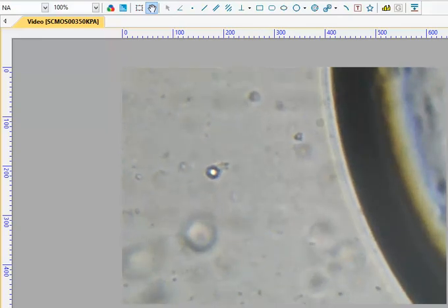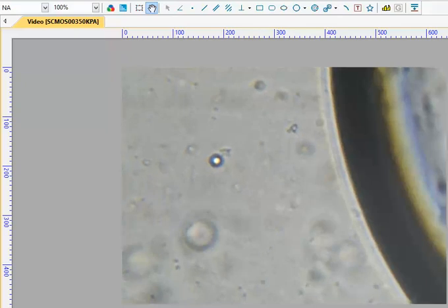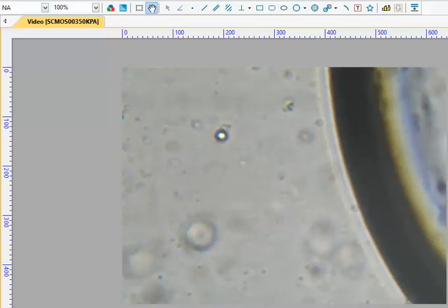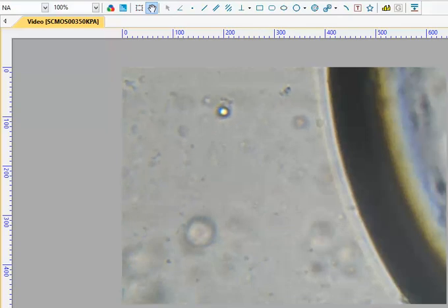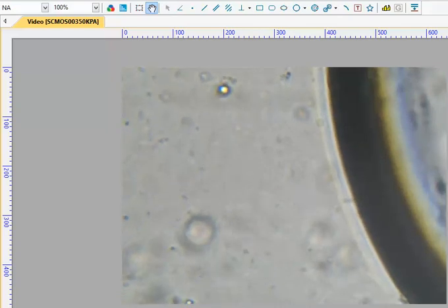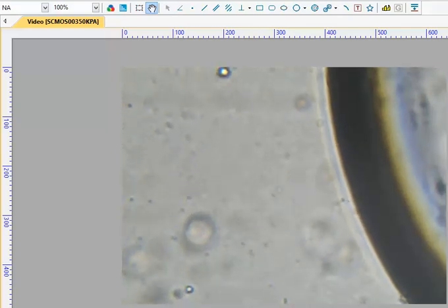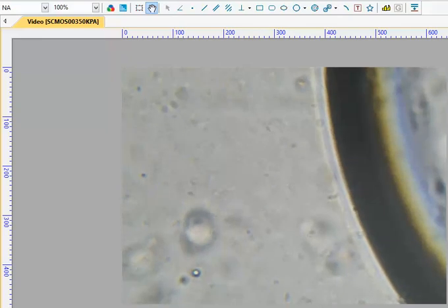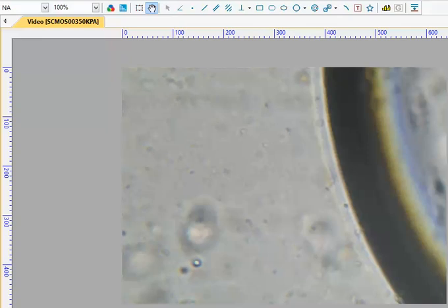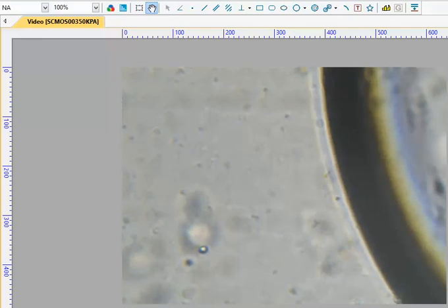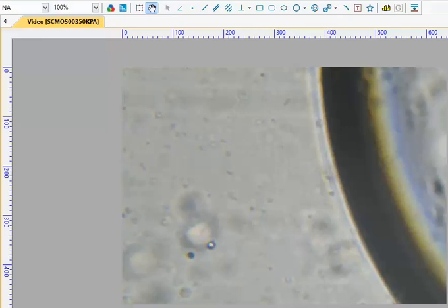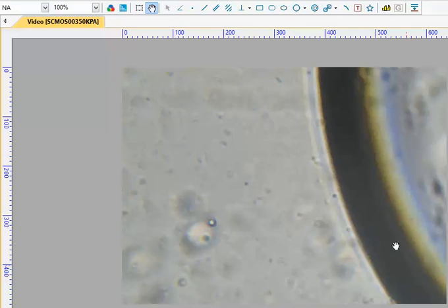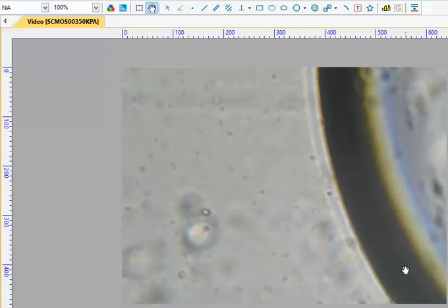This is a drop of water from my kitchen sponge. I haven't used it for probably five hours. This big ring here I think is a bubble.